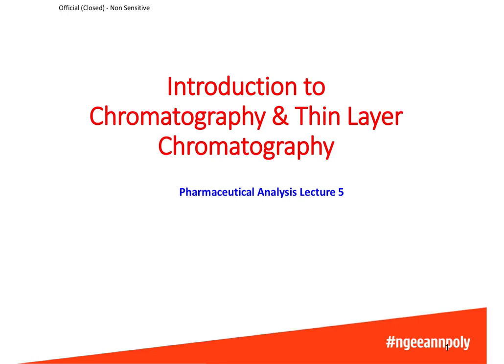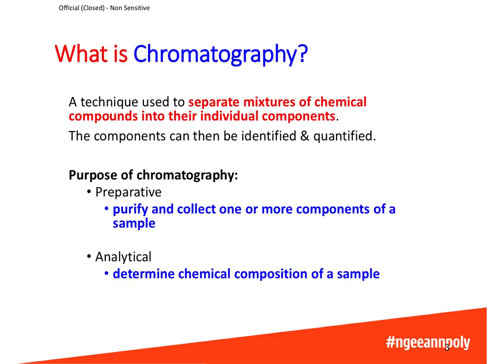In this section, we'll be looking at an introduction to chromatography. In pharmaceutical analysis, we want to identify or quantify certain compounds. But many times, these compounds may not be in the pure form. They may be contained in a mixture. So chromatography is an important technique that we can use to separate these mixtures of chemical compounds into their individual components.